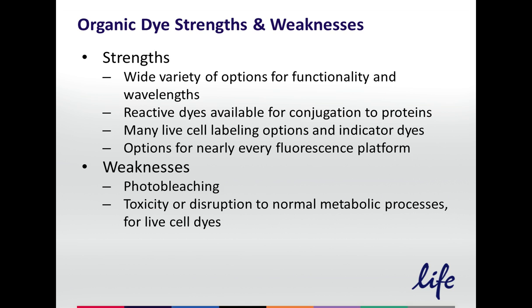Weaknesses are that, as with some other fluorophores, organic dyes will photobleach over time as you shine the light on them, and they start to go away. They photobleach. And this leads to a dim signal.